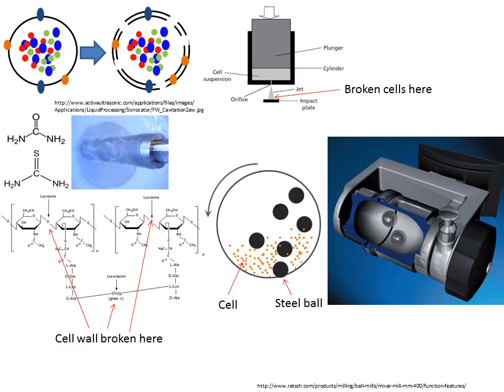The dry sample is placed in a liquid nitrogen cooled metal canister with a metal ball, sealed and shaken back and forth really fast. The metal ball smashes the cells into the sides of the canister and shatters them. This is performed until the sample has a consistency of fine talcum powder, which can then be suspended in liquid with different mixtures of buffers, chaotropes or surfactants so that the protein molecules will go into solution. So in short, if you can't break the cell open efficiently, you can't access all of the proteins, and if you can't get the proteins into solution to be analysed, you will end up with an underestimation of the proteome.